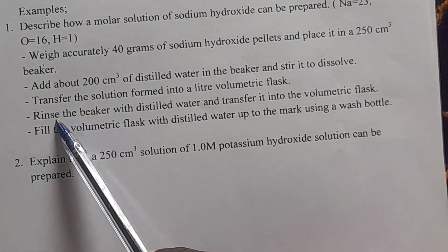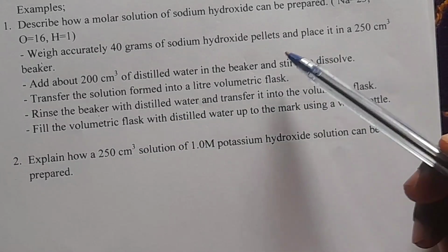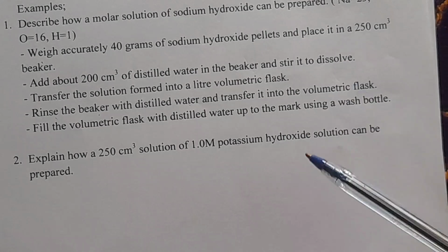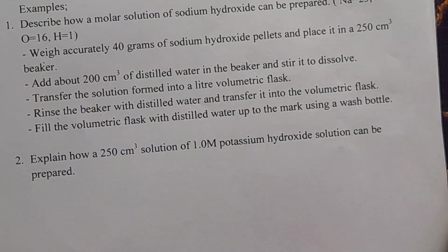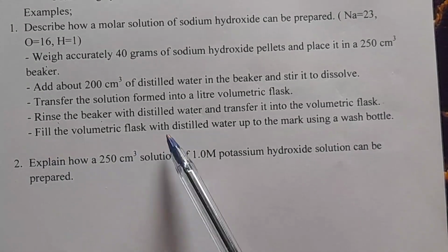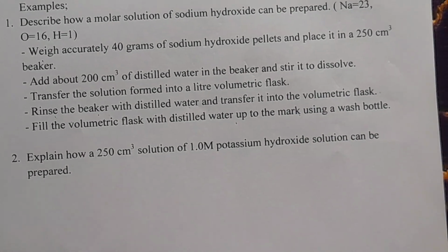Then rinse the beaker with distilled water and transfer it into the volumetric flask, because the beaker you used in dissolving the sodium hydroxide, when you have transferred the solution to the volumetric flask, still has some traces of the solution. So we rinse to remove those traces of the solution. Then you fill the volumetric flask with distilled water using a wash bottle up to the mark. That's the last procedure.